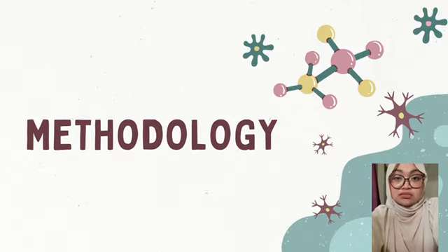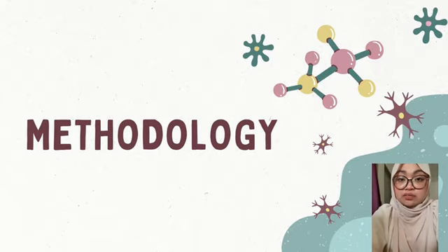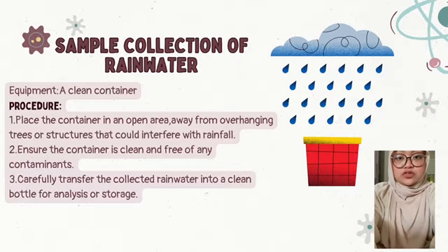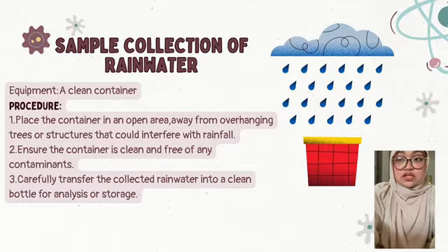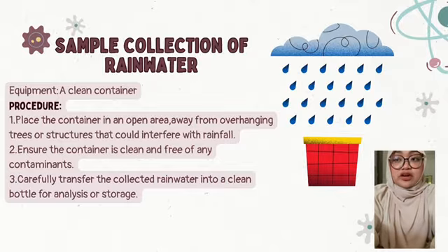Hi, my name is Nur Amisha Alila, and I would like to present the methodology of our topic. For our topic, we use two methods. The first one is sample collection of rainwater. For this experiment, we use only a clean container for the equipment.